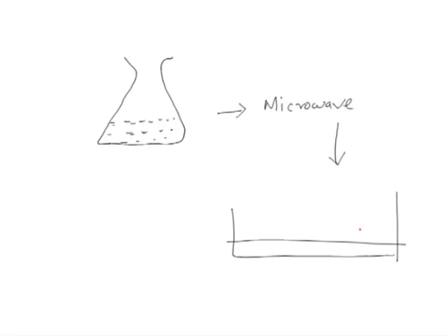Now, you can pour this material in, either through a glass rod, or very carefully from the sides. What will happen is that it will distribute evenly onto this gelling apparatus. Once you have poured it, if you see any bubble, you can push it aside or remove it with a tip or otherwise.